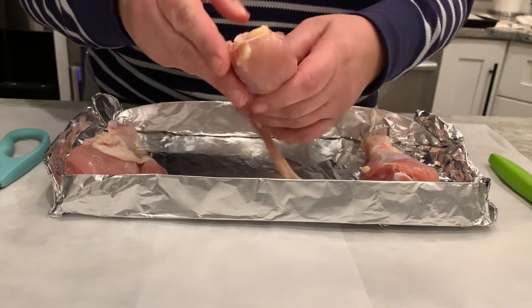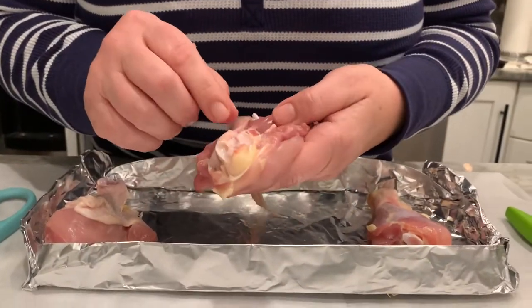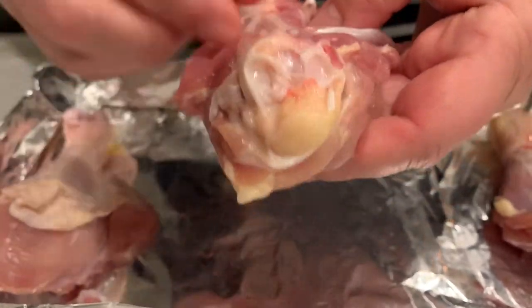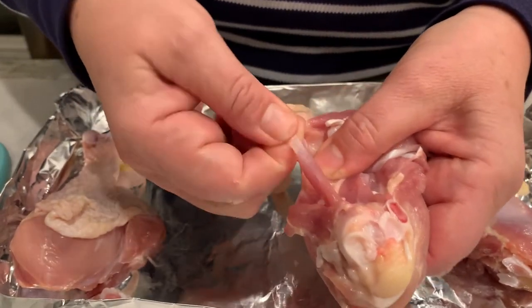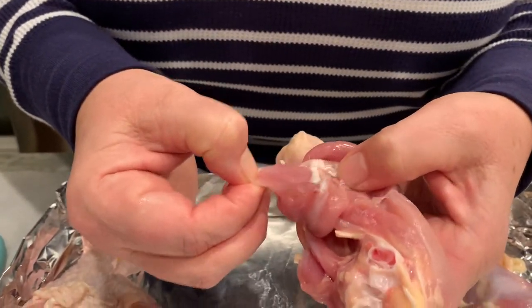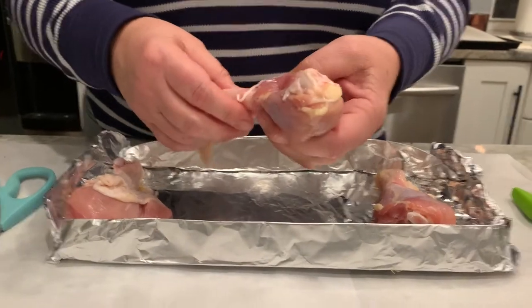We saw ligaments at the distal ends, and here's more cartilage. This connects to the thigh. You can see a little blood — that's part of the bone, specifically some red bone marrow. This here is a tendon connected to that muscle bundle, which connects to the bone at the distal end. And these are nerve fibers running through here — nerves send signals to the muscle telling it to move.